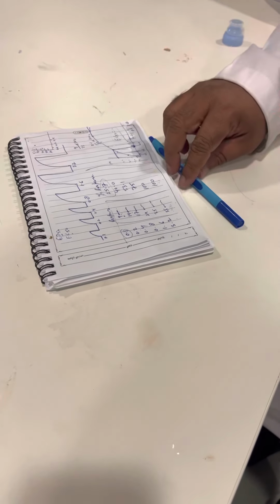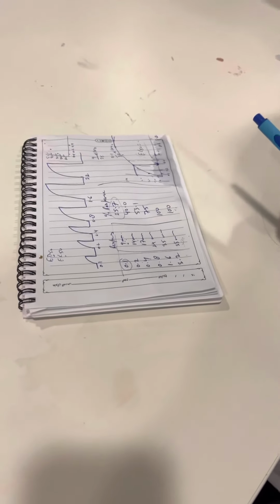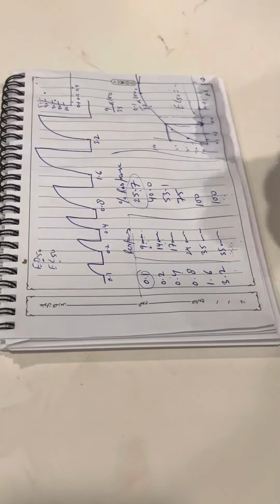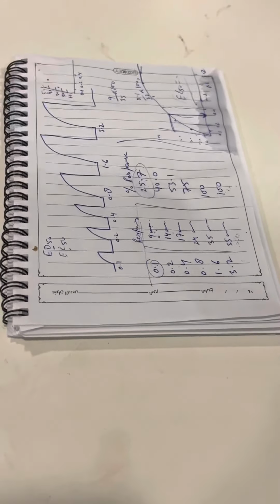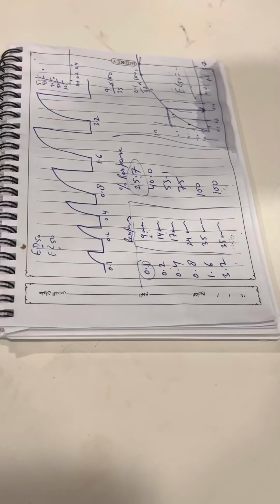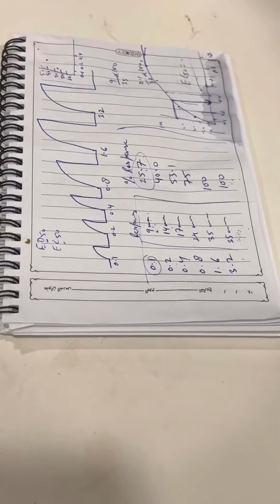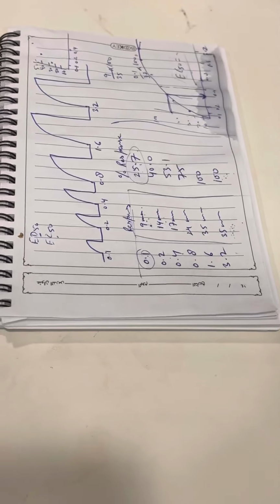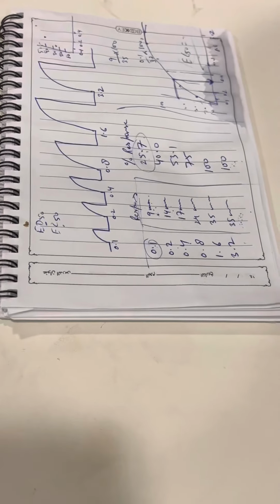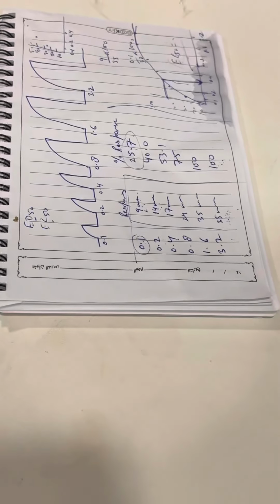It's okay now. So for the calculation of EC50, why do we need this? When you prepare this dose response curve by using the ileum, that's why we are preparing it. If you put this ileum in the machine, then we can prepare the dose response curve of acetylcholine. Acetylcholine is a neurotransmitter.